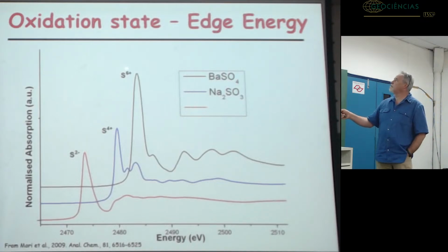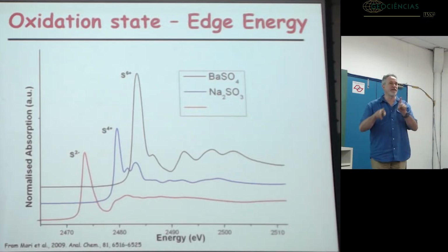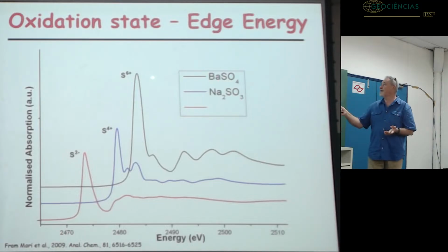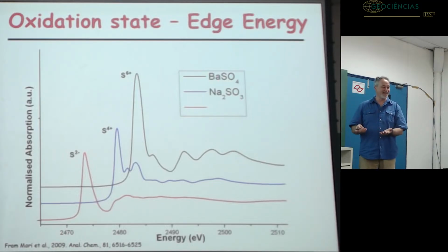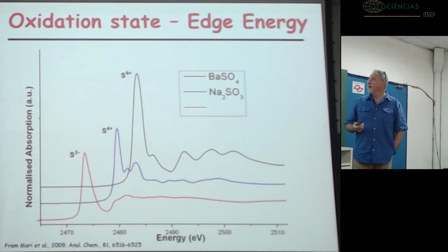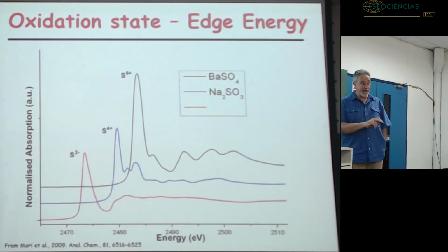And there was a considerable shift of a few electron volts from 2+ to 3+. So in L edge spectra, they don't have a pre-edge peak, but from the splitting of this maximum, they could infer a qualitative determination, but it was something you would see by the naked eye. So you didn't have to fit, and so they said. My impression is that it is not more quantitative than the K edge, for the case of iron at least.